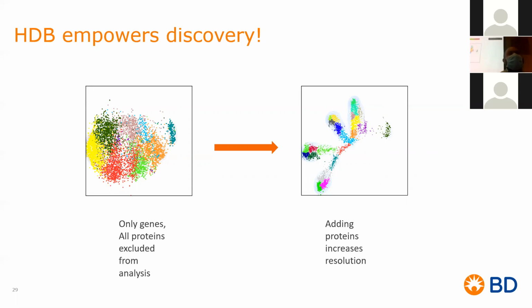If I had only done mRNA, odds are I wouldn't be able to tell you that, or not with high enough confidence. Here, I have the whole story to lay out for you and show you this is what is happening both at the protein and at the gene level. And that's all I have right now. I hope this made sense and why multiomics is very important and the workflow that we do to be able to generate these data.